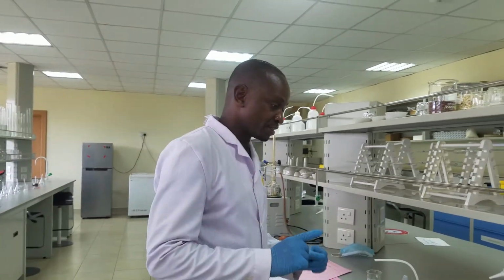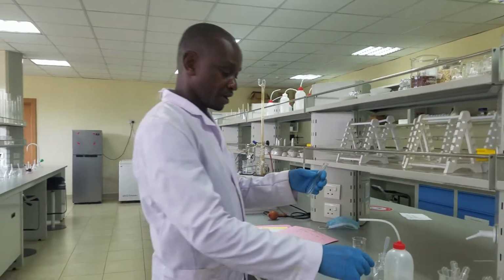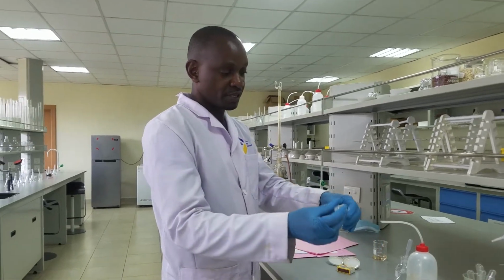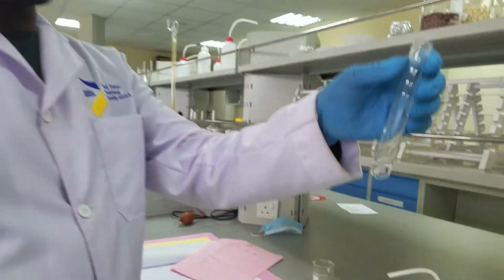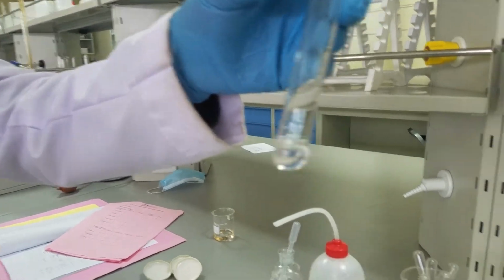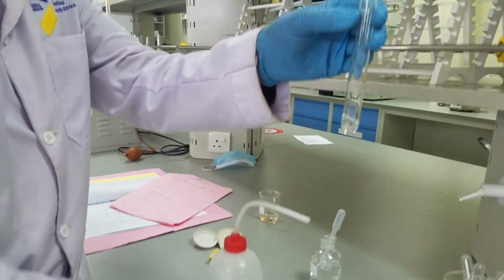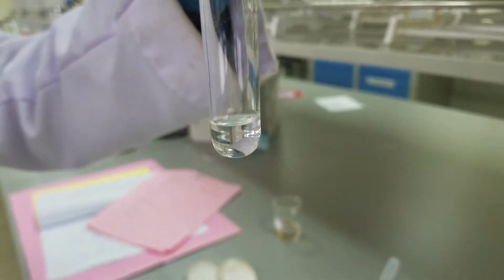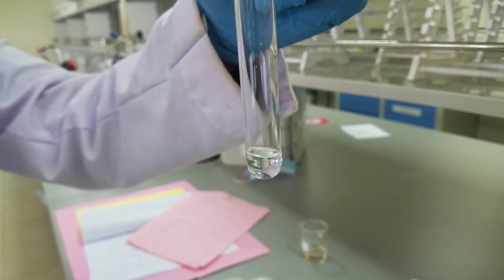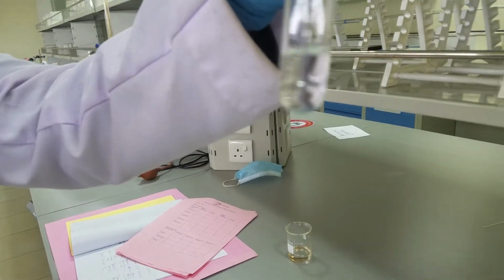Now, our first reaction is this. We are going to take a reasonable amount of heptane, and I would still request that you don't use too much of the solution. Use just a small amount like that. And then we are adding in water. So I want you to be observant to see whether there is any change, whether the two are soluble.